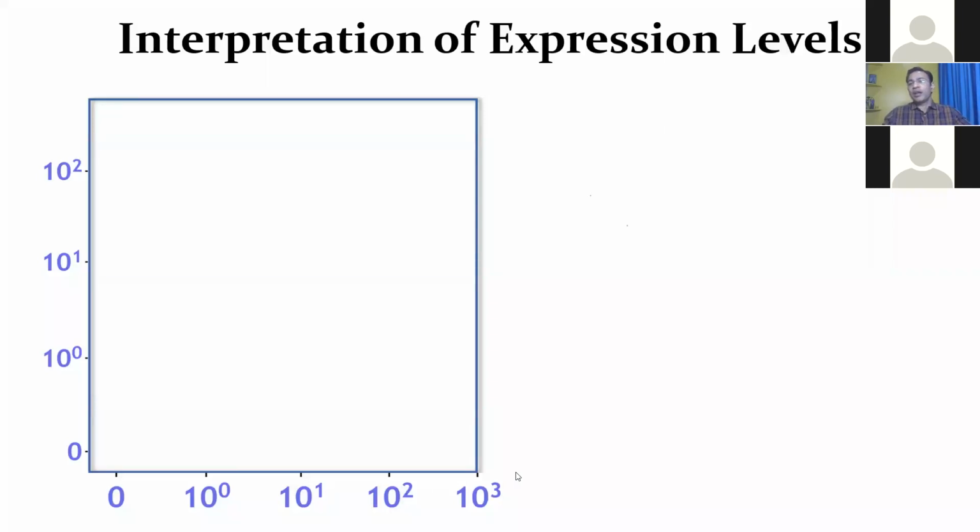So we divide the level of antigen expression or intensity in a logarithmic fashion. We calibrate our instrument in such a way that all the negative population will fall below 10 raised to 1. Now some laboratories can calibrate their instrument where the negative can fall up to 10 raised to 1 or 10 raised to 2. So that depends on the laboratory.